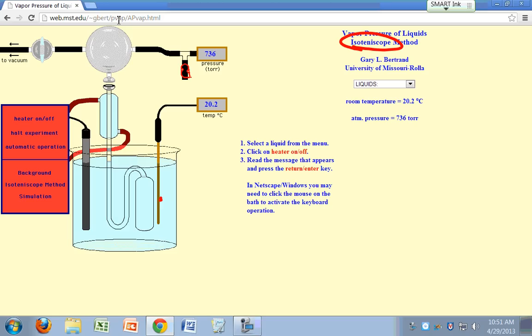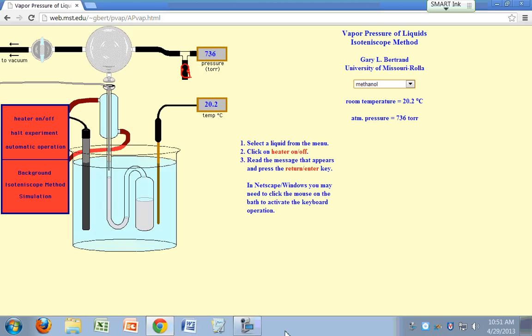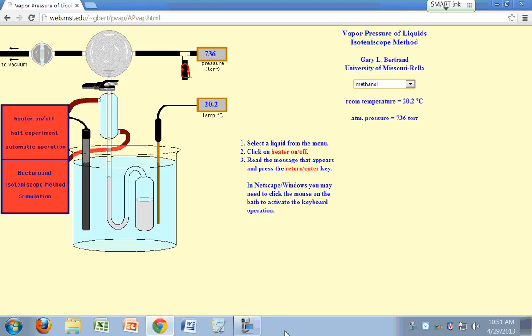If you click on heater, let's first pick a liquid. Let's say you pick methanol. So you're introducing a liquid now, and here's your liquid. This was opened up, and this part right here was opened up to introduce the liquid. There's your liquid right here shown in gray. And now you clamp it back on.